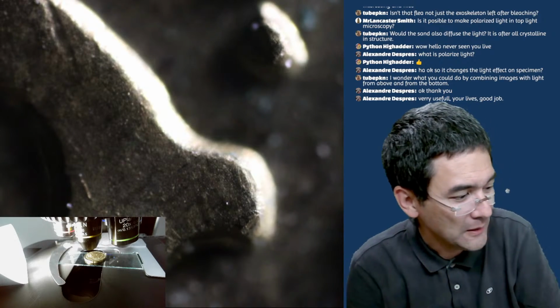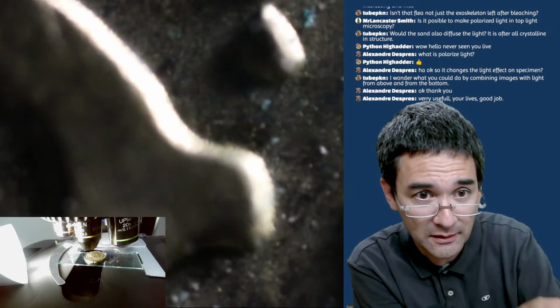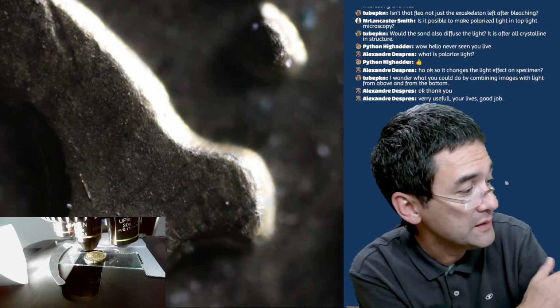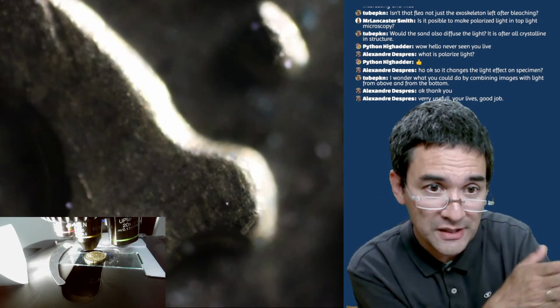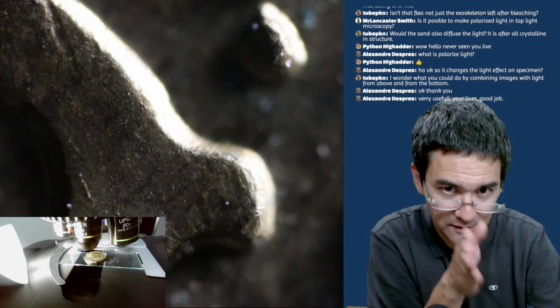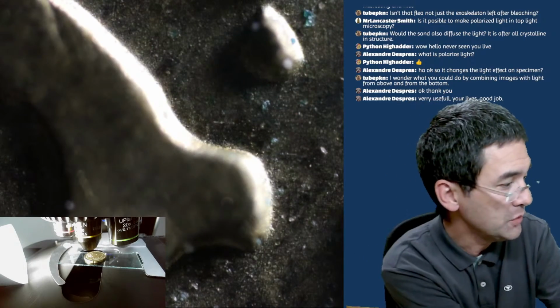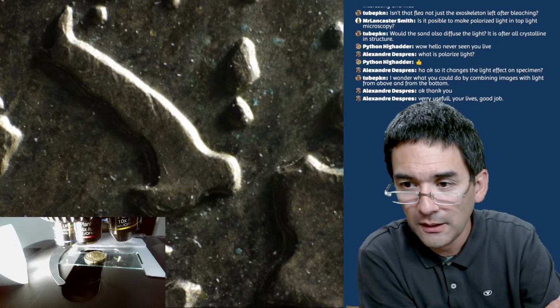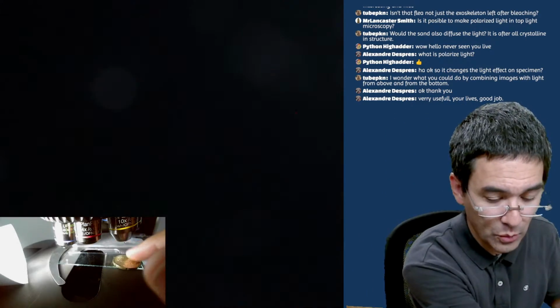So actually, I got pretty good results also by stacking with a compound microscope this way. So I just want to tell you that this is maybe an advantage. The software has an easier time to stack images where the axis is where the objective is. I'm using the 10 times objective now, but I'm going to go back to the 4 times over here. Okay, so anything else I want to show you? Let me see. Okay, this was the coin.